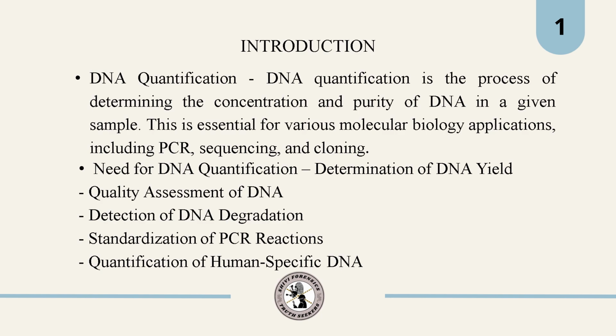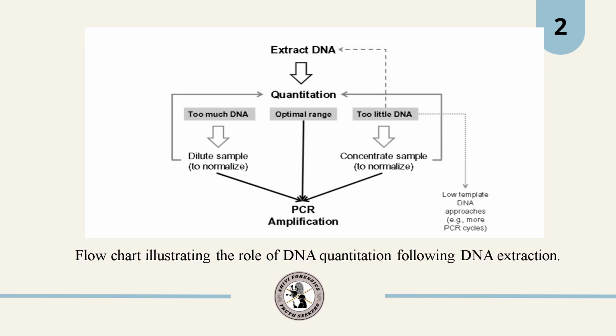The need for DNA quantification is because for further processing, STR analysis and PCR amplification are done, and in these techniques, the optimal amount of initial input DNA is required to get optimal results. For STR typing, the optimal amount ranges between 0.5 nanogram to 2.0 nanogram. To get this optimal amount, further standardization of the input DNA sample is also done by using different methods.